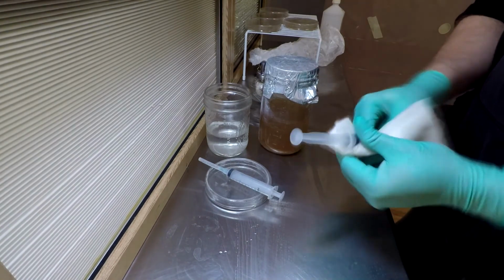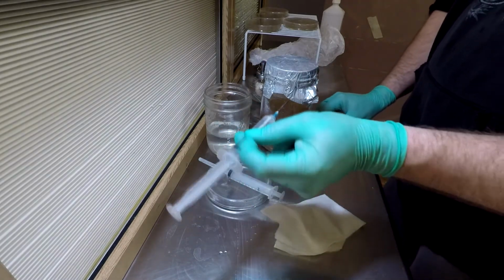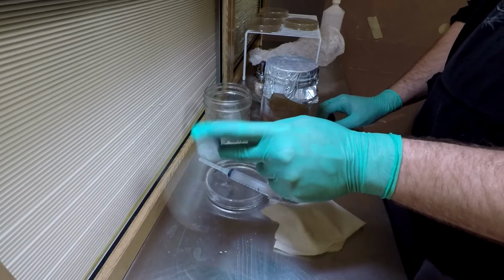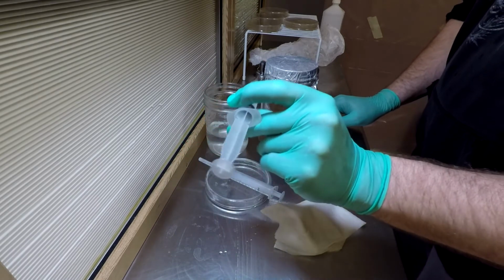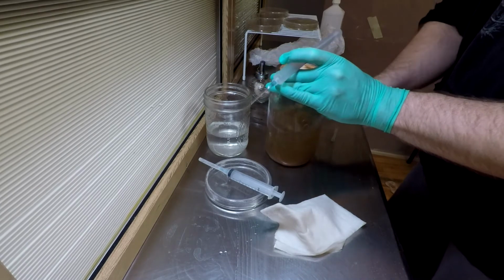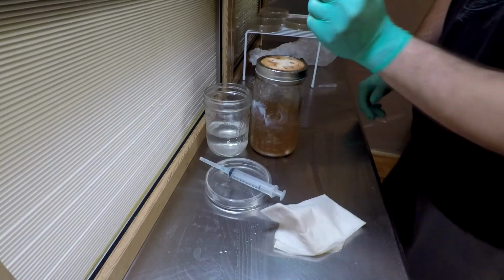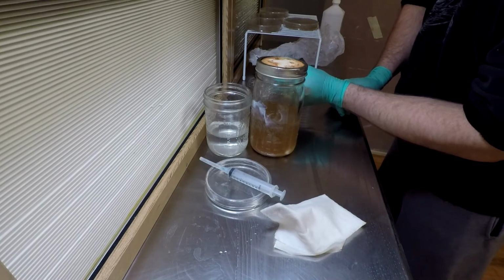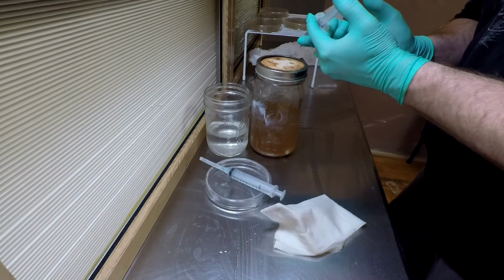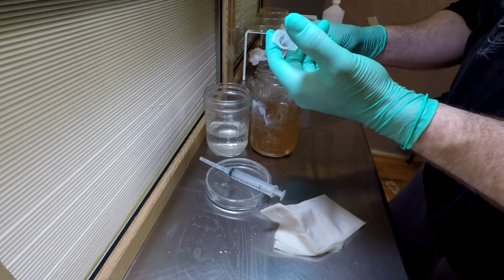So, wipe this down real quick. Do the same thing I did yesterday where you waggle it back and forth, just spread the spores out. That looks good. Alright, I'm just going to sterilize the outside of this needle. So it spits some steam out. Let it rest for a couple seconds. Then squirt out a couple drops, and then probably won't even put a half a cc, probably about a quarter of a cc in here.